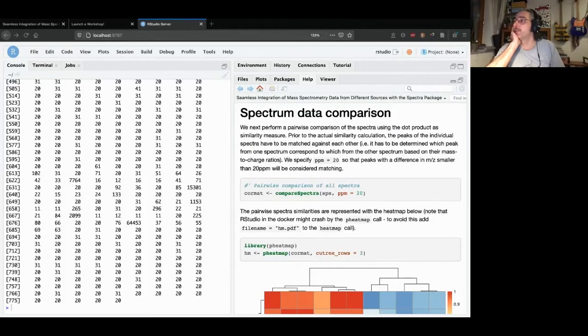The point is you have always the raw intensities there, because we are not changing the raw intensities. But otherwise, it's not really possible, I'd say. The way how you could do that is you have one Spectra object with the processing steps and one where you call reset on that, so we have them two in parallel, or you call just reset before you, you know what I mean? You call reset before you do any operations, and you have directly the comparison of the raw to the processed intensities or mass to charge ratio values.